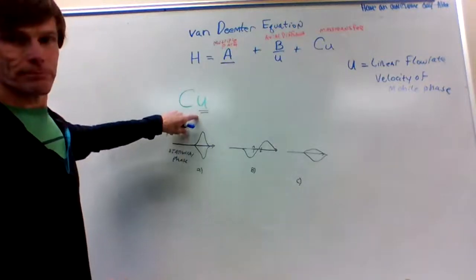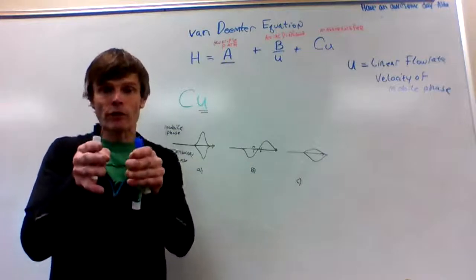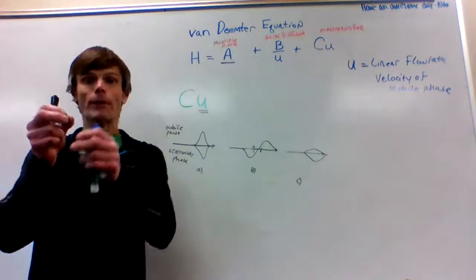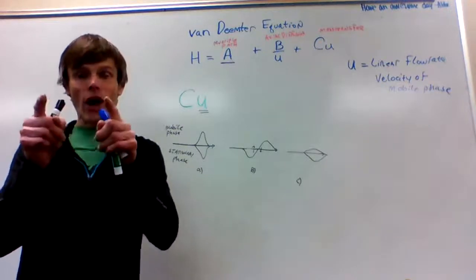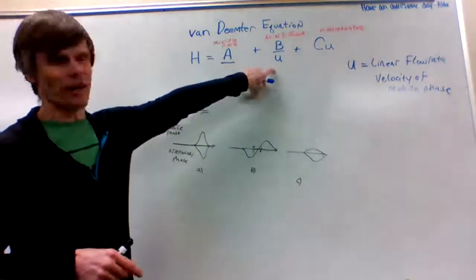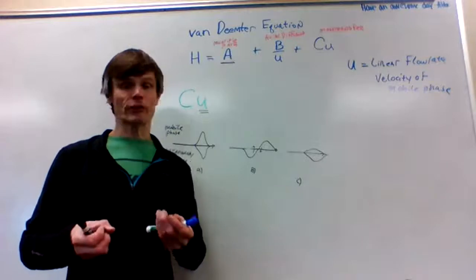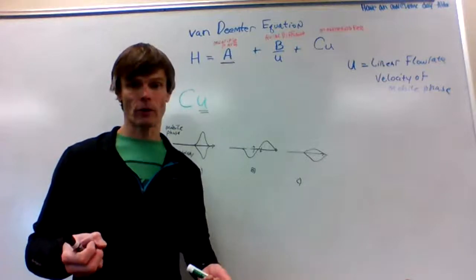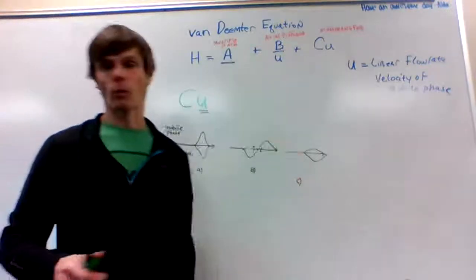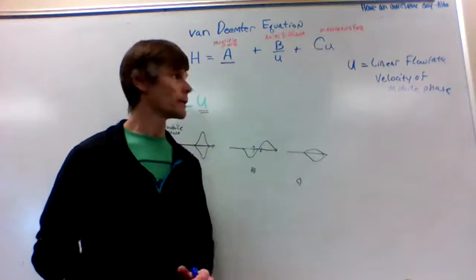So that's not good. If we slow this down a bit and allow them to re-equilibrate as we start to move slowly down the column, then we're going to get better mass transfer, and we're not going to get as broad peaks. But once again, that offsets our axial diffusion. So what we see in these cases is that there's a fine line that we're balancing. We don't want to move too slow. If we move too slow, we're going to get a lot of axial diffusion. It's going to cause our bands to broaden.